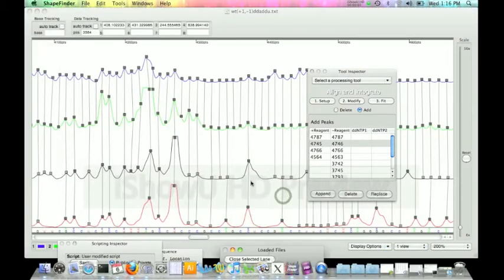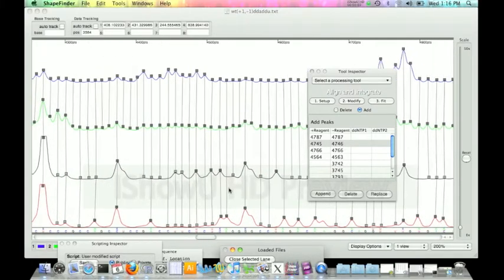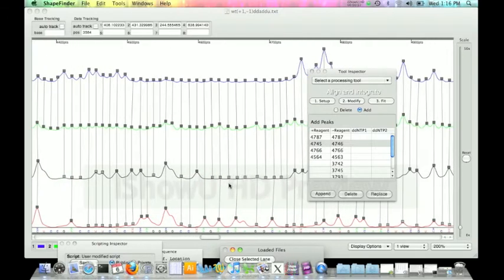Now we would like to basically go through and sequence our data according to our sequence and according to our ladders. This is the part where it gets a little iffy, but you really have to take some time with it and really look at it. So what you see down here lists off two rows. The bottom row is the actual sequence itself, and the top row is the sequence according to the ladders.